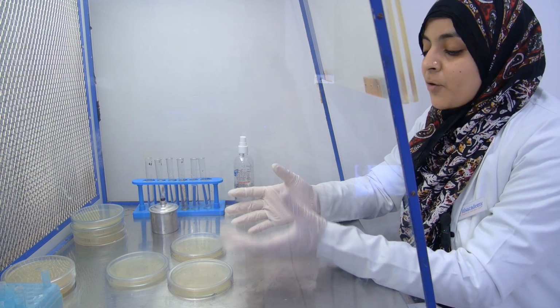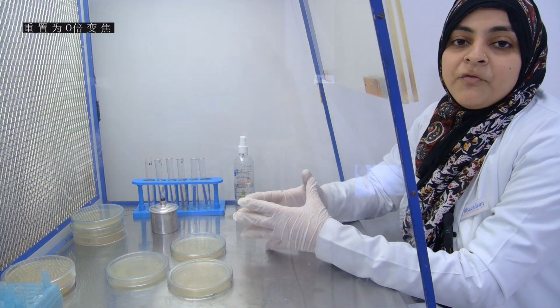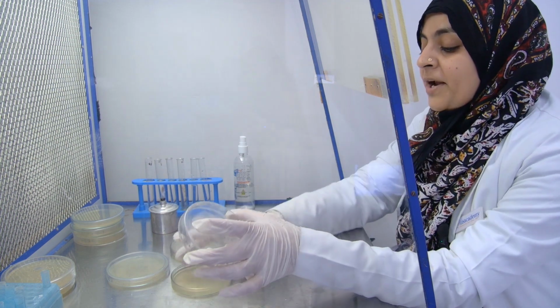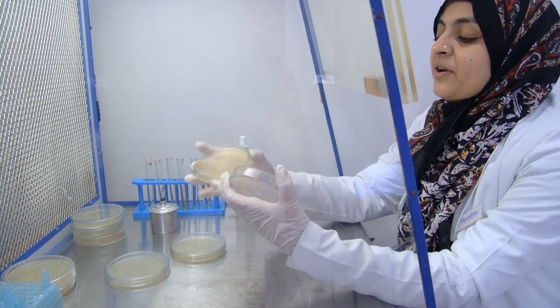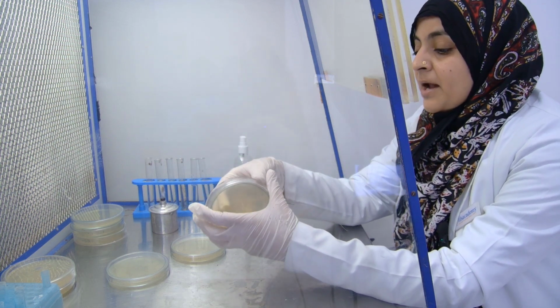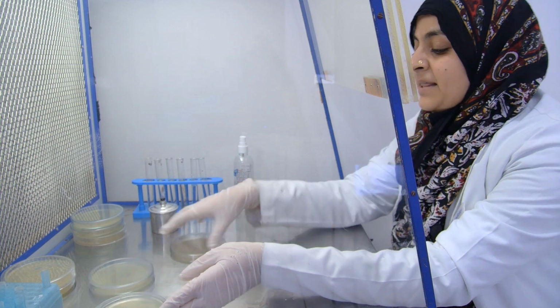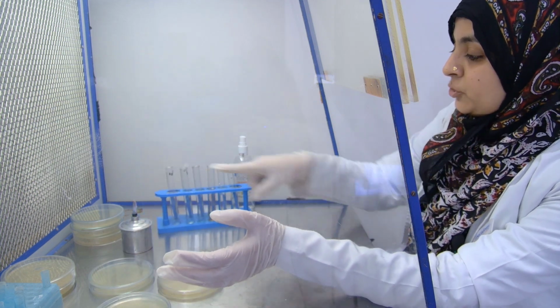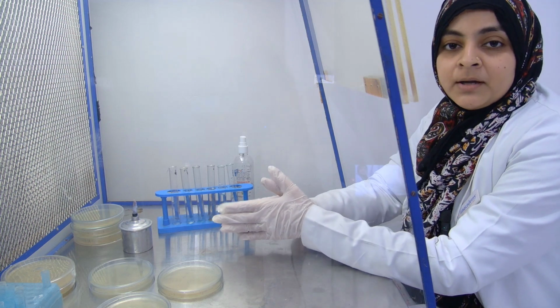After 20 minutes, we take out the media from the autoclave and pour it into the plate and leave it for solidification. See, this is solidified. Now at that time we perform a serial dilution. This is our serial dilution tubes.